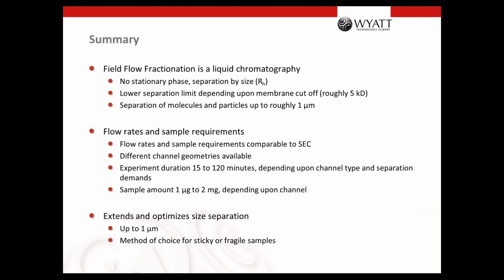Then, of course, if the particles are getting even bigger, FFF is a good option. And it's also the method of choice if you have a very sticky sample or very fragile samples, like the liposomes I showed you before, but also particles.